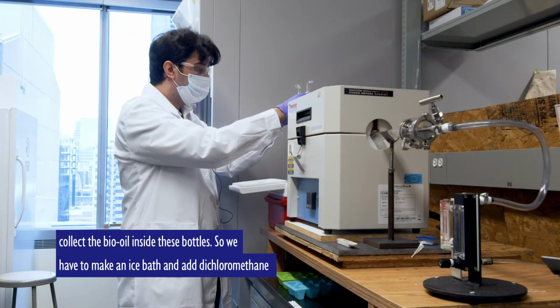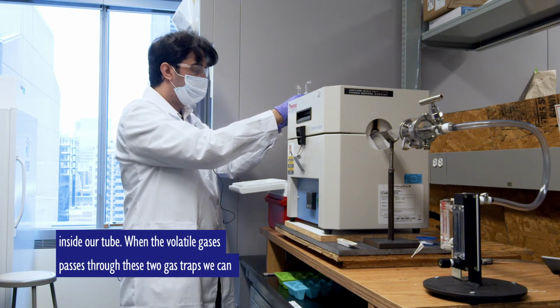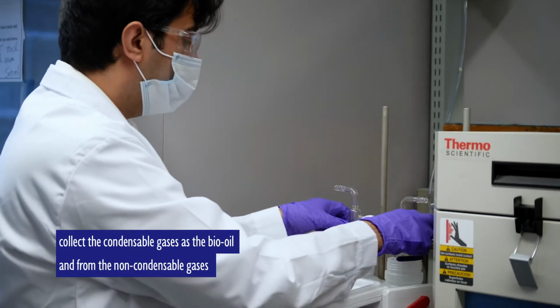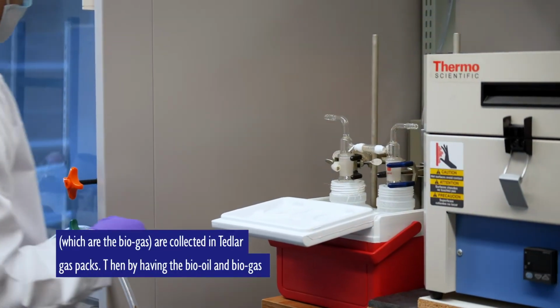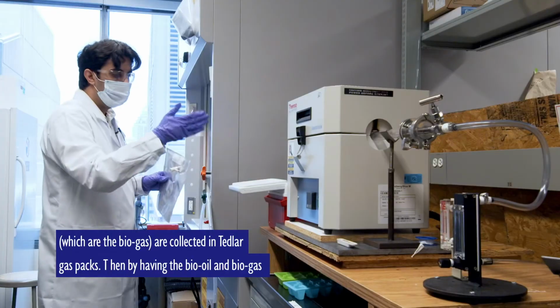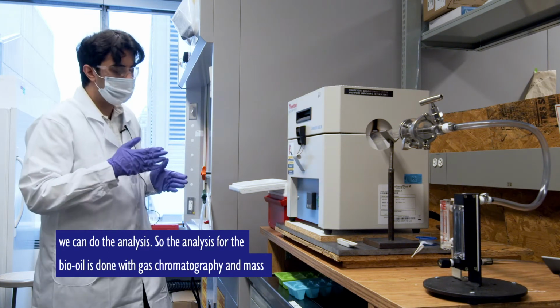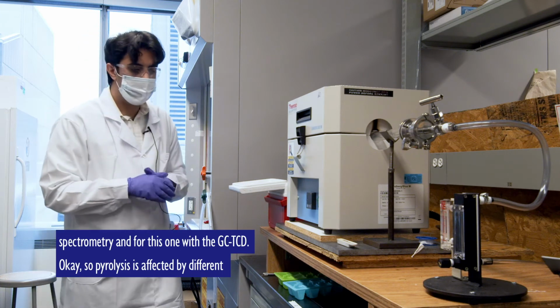bottles. So we just have to make an ice bath and add some dichloromethane inside our tube. So when the volatile gases pass through these two gas traps, we can collect the condensable gases as the bio oil. And from the other end, the non-condensable gases, which are the biogas, are collected in Tedlar gas bags. Then by having the bio oil and biogas, we can do the analysis. The analysis for the bio oil is with gas chromatography mass spectrometry, and for this one it is with the GC-TCD.